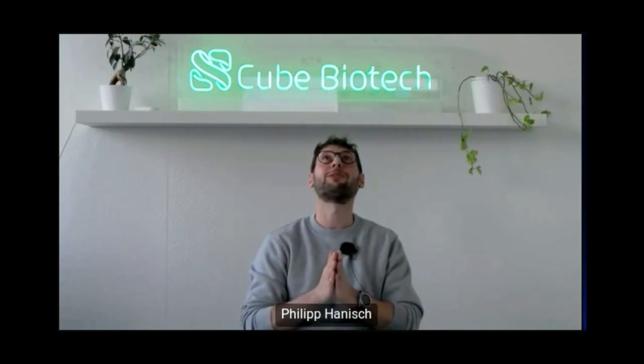Yeah. Of course, when we use NativeMP, when we use copolymers, we don't have any detergents in there, so a lot of these issues already fall away. We can make sure our protein is stable. We see in cryo-EM that it works very well, that the structure is still there. We have seen a lot of examples in the literature, in the community, that we can retain the natural oligomerization state in copolymers. In detergents, you often end up with monomers where you should have a dimer, or with homodimers where you're actually looking for heterodimers.